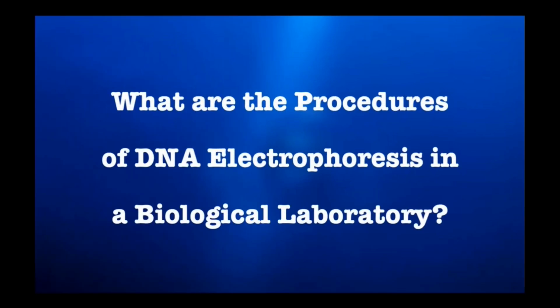And next, what are the procedures of DNA electrophoresis in a biological laboratory? In our laboratory experiments, we actually apply DNA electrophoresis several times, and let me explain the specific procedures later.